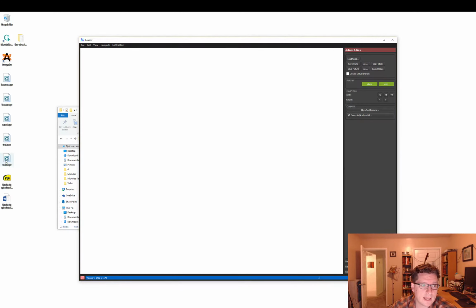So let's drag in that weird molecule. Bam. There she blows. With both mouse buttons held down, you can drag the molecule around like this, so you can center it. And then with the right mouse button, you can kind of spin it around.